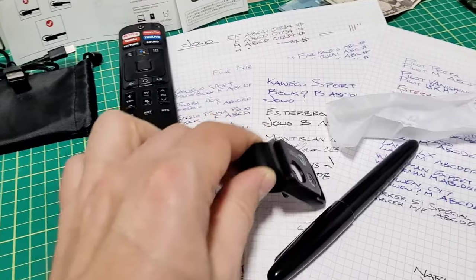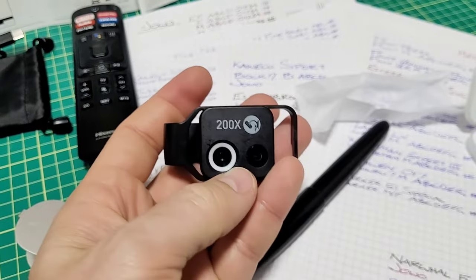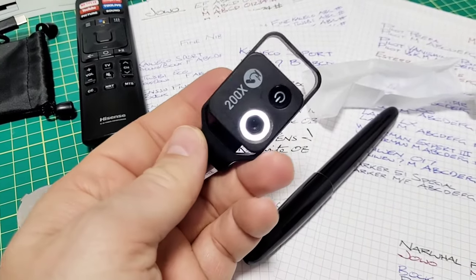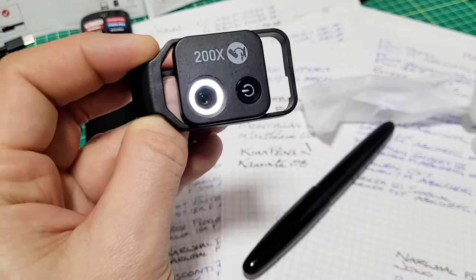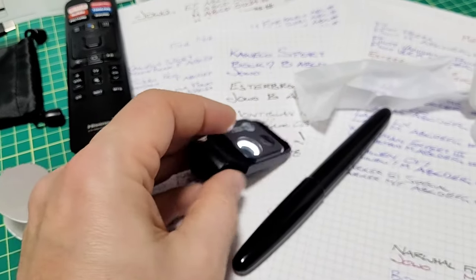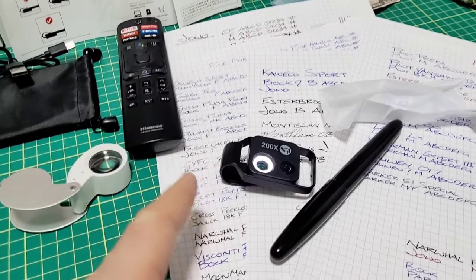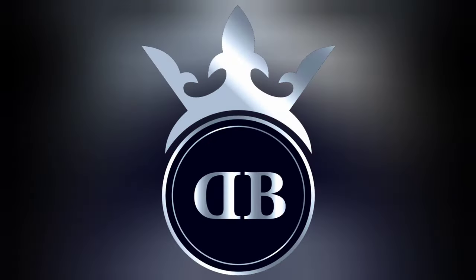For every task I threw at it, this thing has worked quite well. I really enjoy this — it would be great for a classroom, teachers, all those sorts of settings. Very economical and affordable. I always wondered if these things worked — you see pictures of them all over the place, sometimes with telephoto lenses — I was always skeptical. But I'm actually quite impressed, especially at the clarity of the magnification. Anyway, thanks to Apexel for sending this over — information is down below. I just got a really cool parcel in yesterday, so stay tuned and we'll catch you next time.